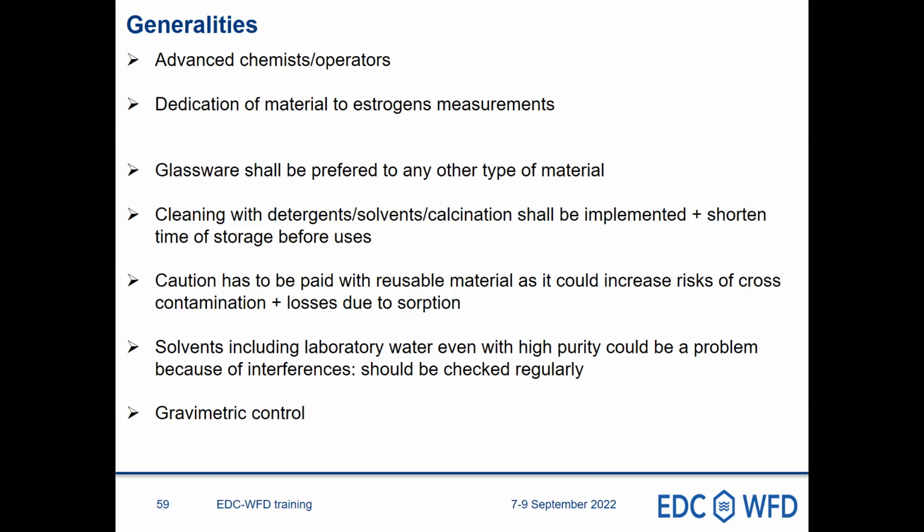Solvents, including laboratory water, even high purity water, could be a problem because of interferences and should be checked regularly. And we also recommend gravimetric control of all the operations to be sure to be robust and reliable. We are dealing with such low levels of concentration. Everything should be under control.